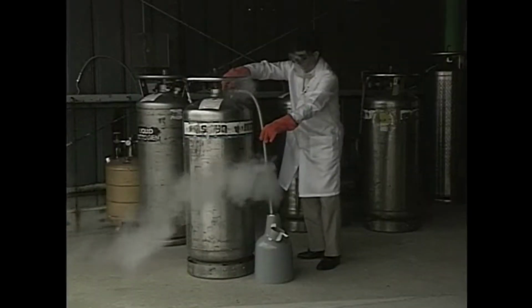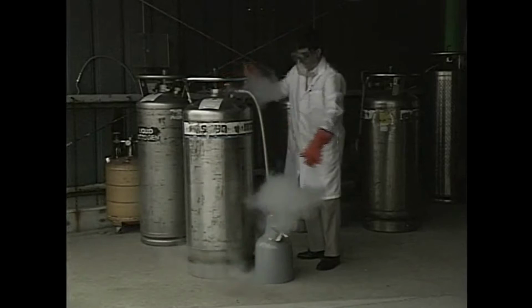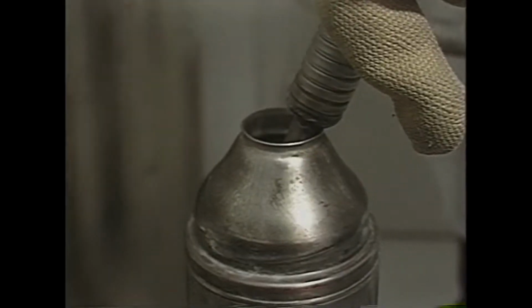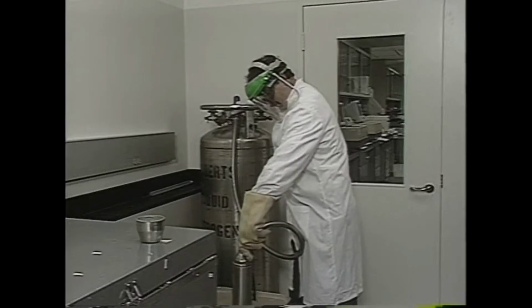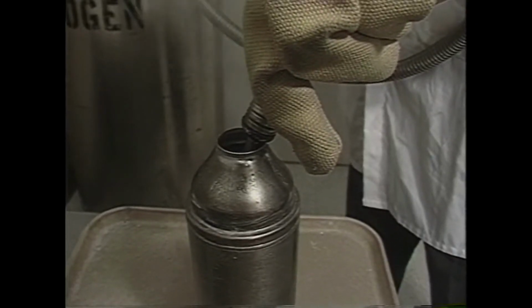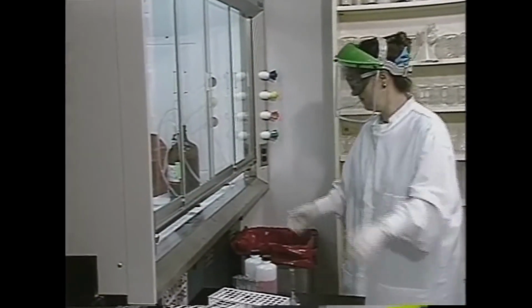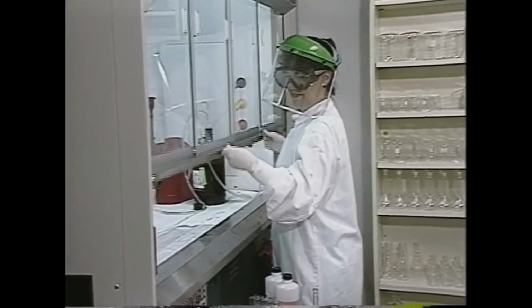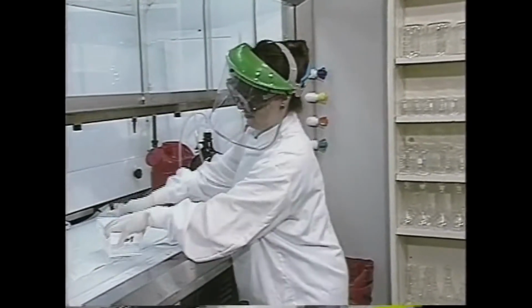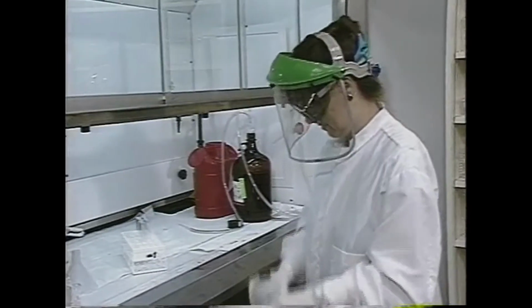When selecting PPE, remember to consider all the hazards that a material presents. For example, when working with cryogenic liquids, you need to wear goggles and a face shield to defend against splashes, and insulated gloves to protect your hands. Laboratory hoods are the most common engineering control used in the lab. They can protect us from hazardous chemicals, but only if we use them properly.